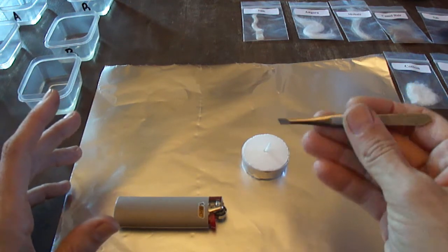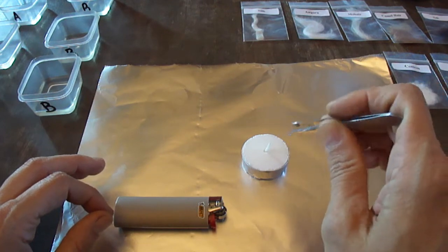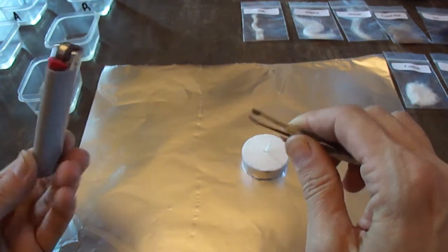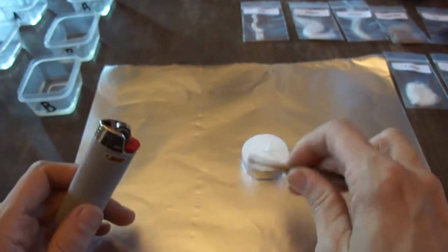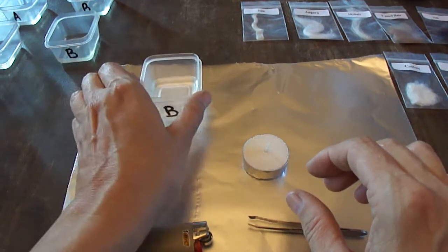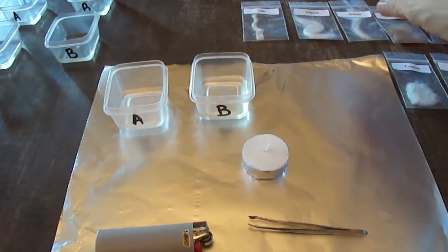I've got a pair of tweezers — I feel like these are pretty essential because it's really hard to get your tiny bit of fiber or fabric into the flame without hurting your hands. Without tweezers you could use scissors or chopsticks, something like that. And then a lighter, and I've got little plastic containers for my chemical solvents.